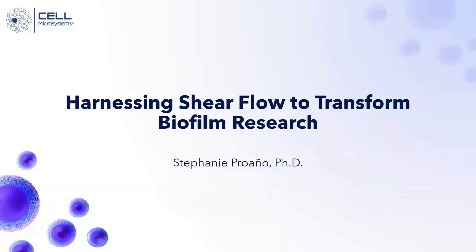So Stephanie, for our first question, what advantages does shear flow in the Bioflux provide when studying biofilm formation, dispersal, and treatment response? Yeah, that's a great question. The advantage is that with shear flow, we can study biofilms as they happen in vivo, of course, when the microorganisms normally in vivo grow under shear flow conditions. So with the bioflux, we can provide that. We can mimic their in vivo environment and then track more physiologically relevant responses.